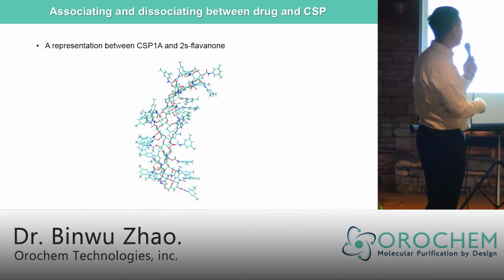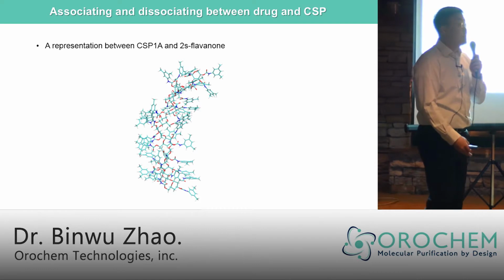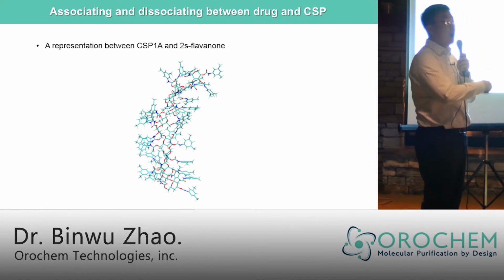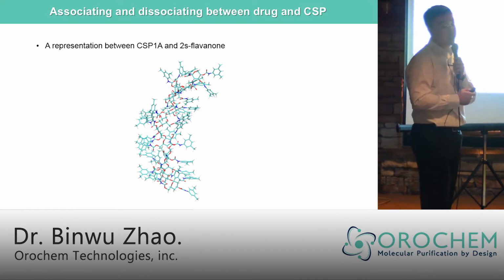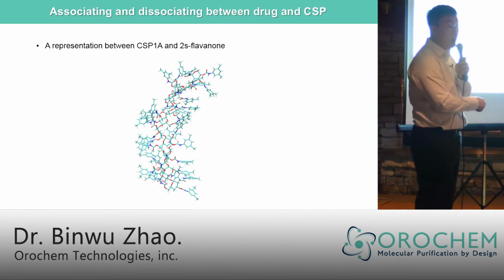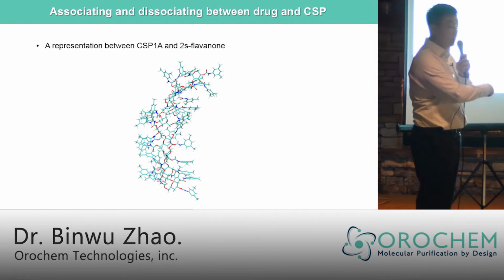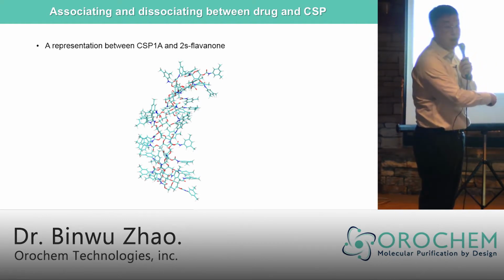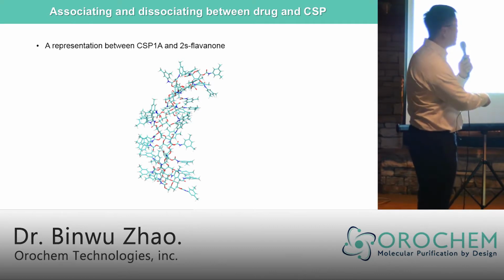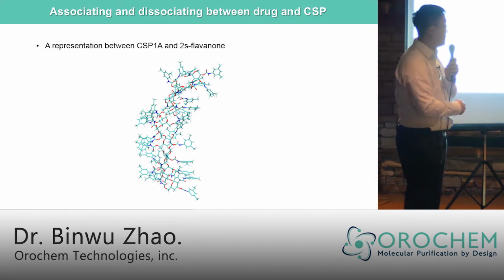There you go. It's leaving the big guy. So this is a classic representation of how the CSP is interacting with the drug. I'm not presenting all the solvent molecules. In the actual simulation, there will be tons of solvent molecules around these two. And here I'm only presenting the interaction between the CSP and drug.